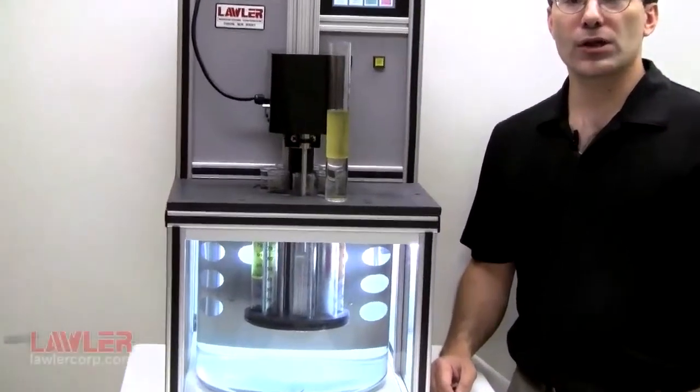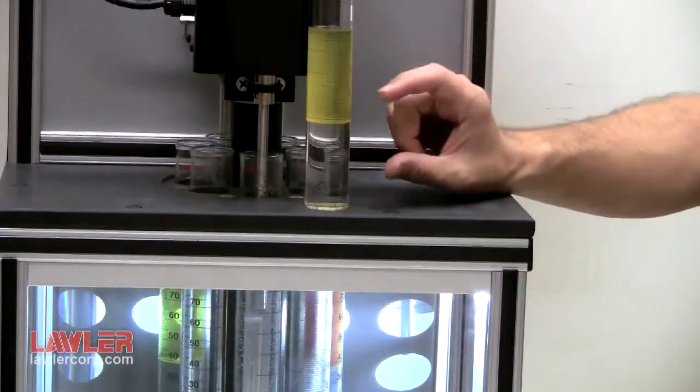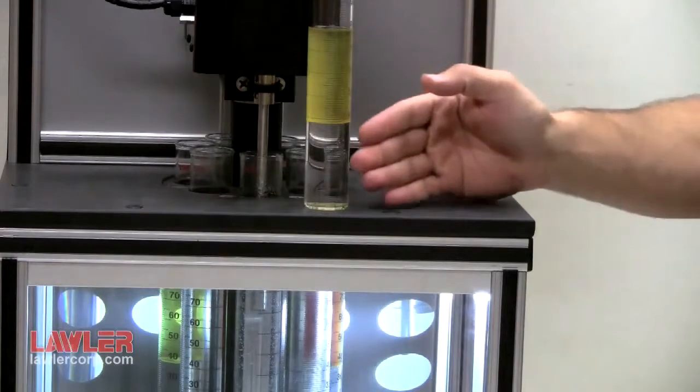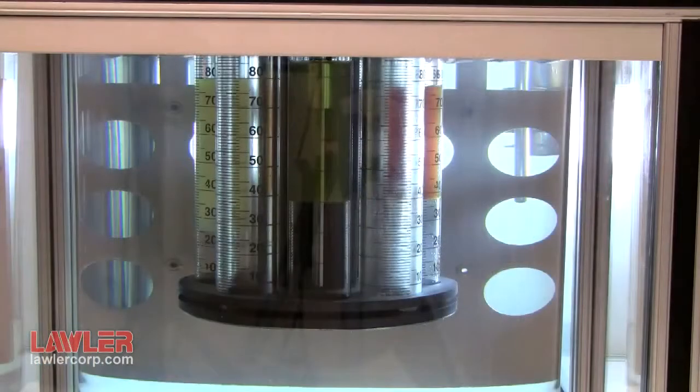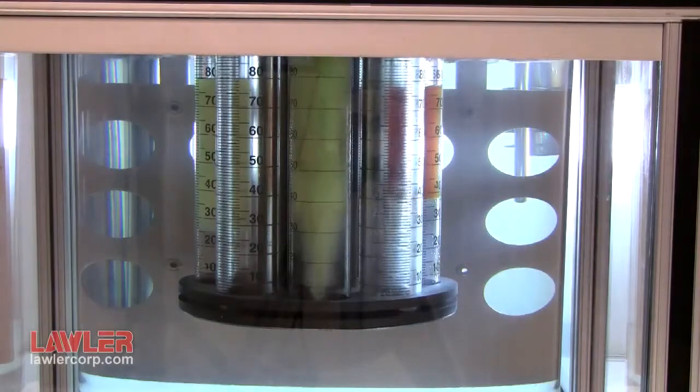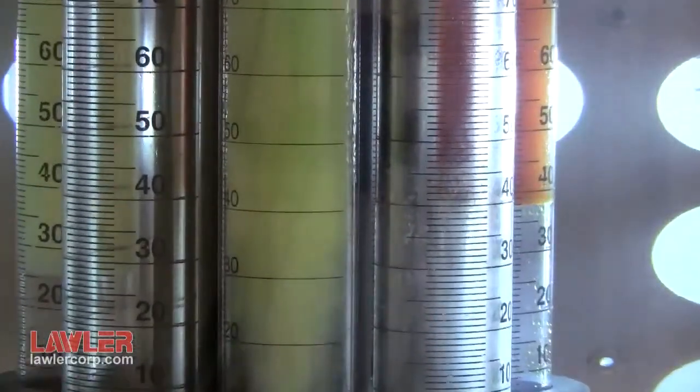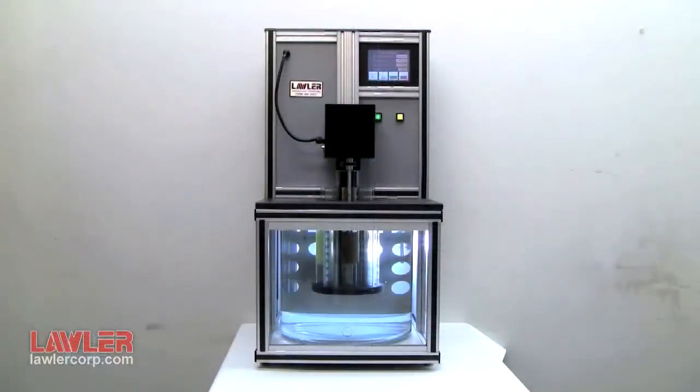ASTM D1401 Water Separability Method takes equal parts of lubricating oil and water in a graduated cylinder, then vigorously stirs them at 1500 RPM. The resulting emulsion must separate back to oil and water quickly for the oil to be considered good. This video reviews how the Lawler Model 305 not only performs the test, but has features to improve precision and prevent future maintenance issues.